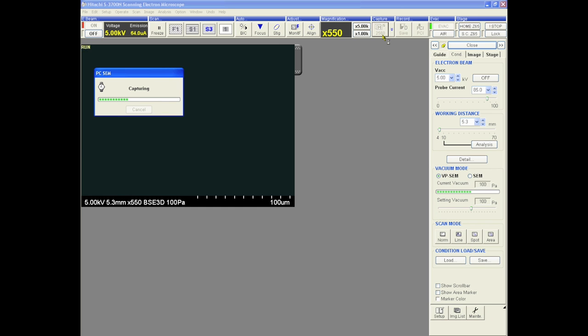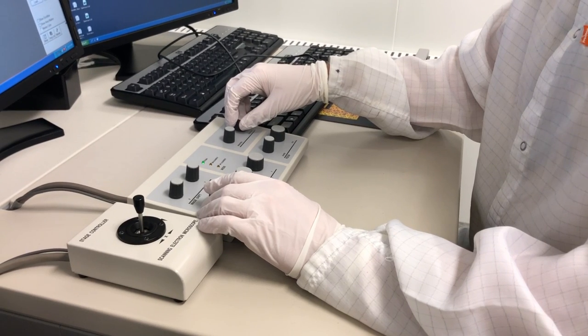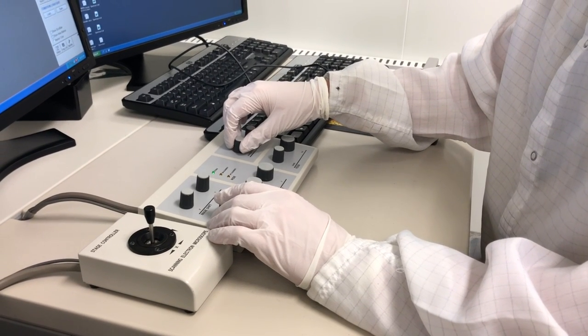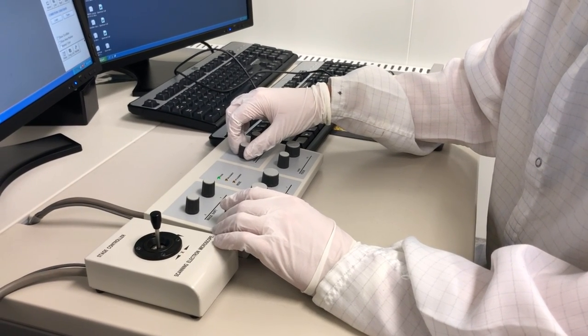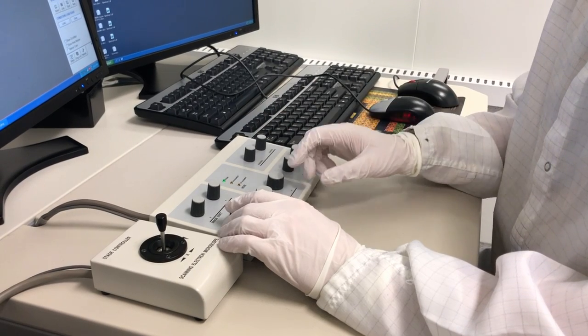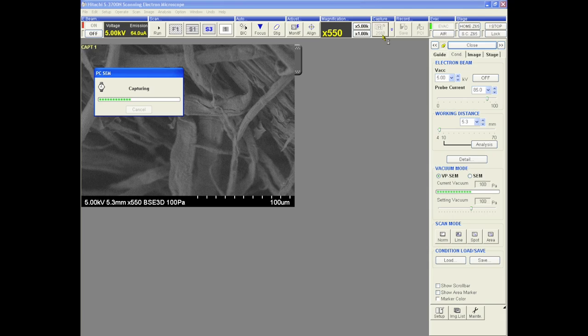Once you are able to see an image, continue adjusting the focus, voltage, vacuum level, probe current, brightness and contrast, aperture and stigma to create a clear picture. Refer to notes from the training session for details.